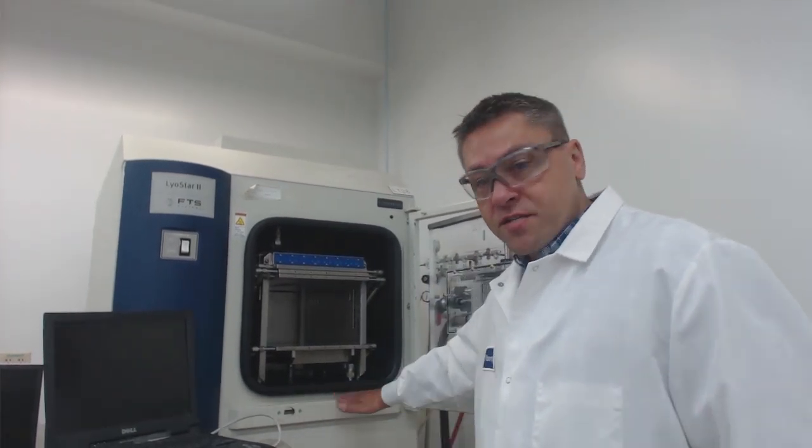That's important to remember because some lyophilizers do not come with a spool piece. They may just have this product chamber and right next to it where the shelves are placed is the condenser, meaning very cold coils. Those coils can influence the temperature of your product. It's neither good or bad, but it's something to be aware of when developing your process and transferring it. Other lyophilizers still may not have a neck, but just this wall in between the chamber and the condenser with a plate that raises and falls depending on the stage of the process.